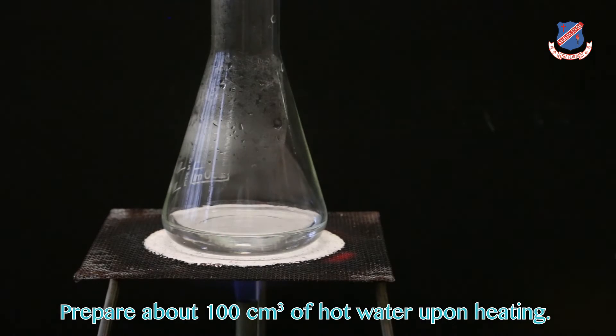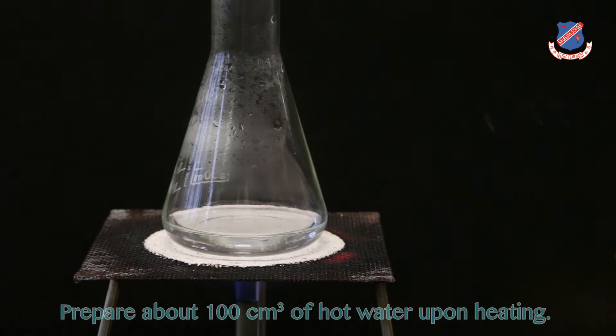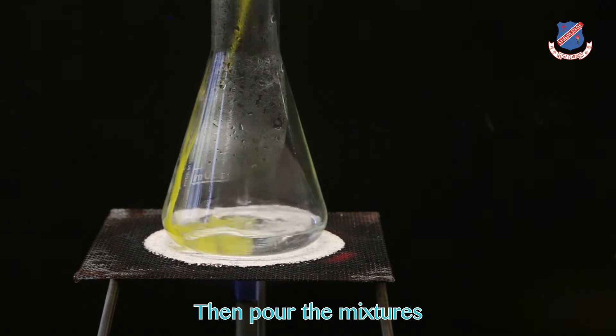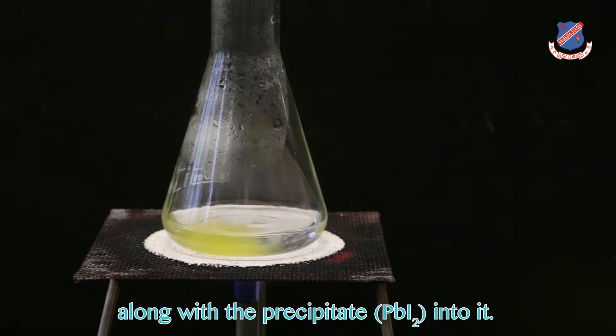Prepare about 100 cm³ of hot water upon heating. Then, pour the mixture along with the precipitate into it.